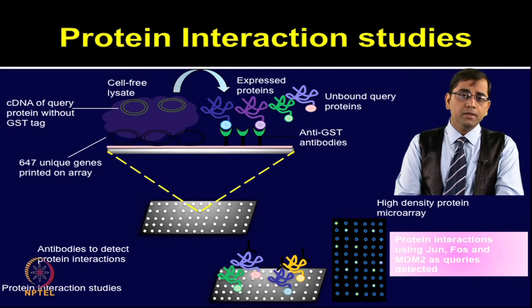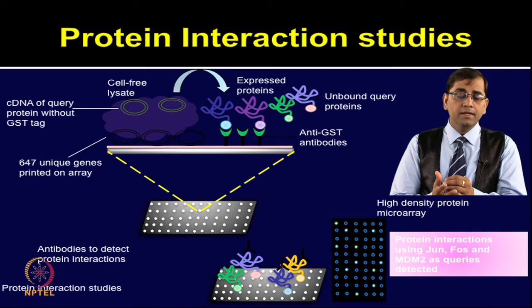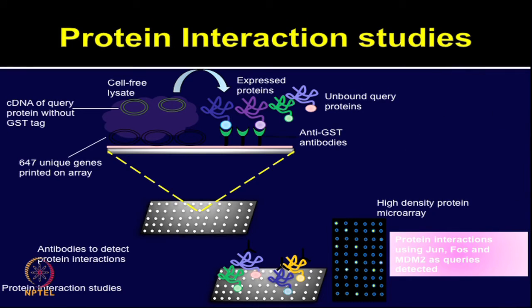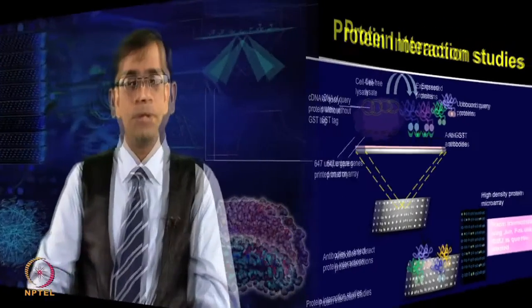In addition to showing that protein expression and protein interaction works, it was also interesting to perform the co-expression, where authors showed that even the query protein need not be purified, and one could express that DNA along with the in vitro transcription translation mix printed on the protein chip surface. So, if you have protein microarrays, features are printed on the chip, and then you have generated the contents by using a cell free expression based system.